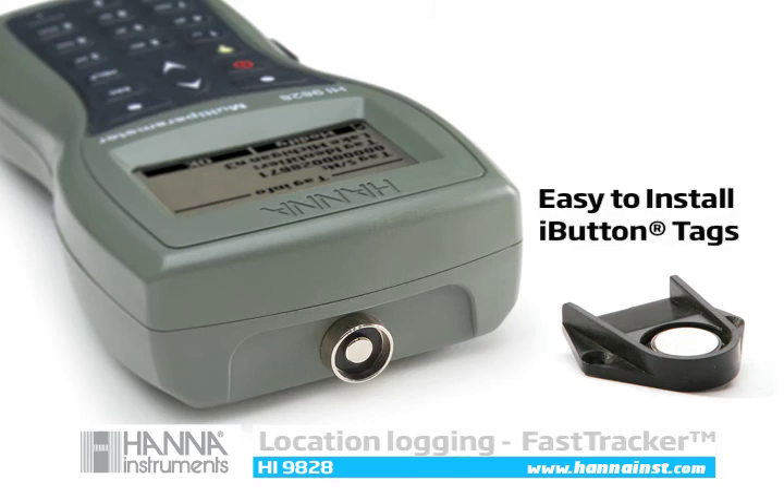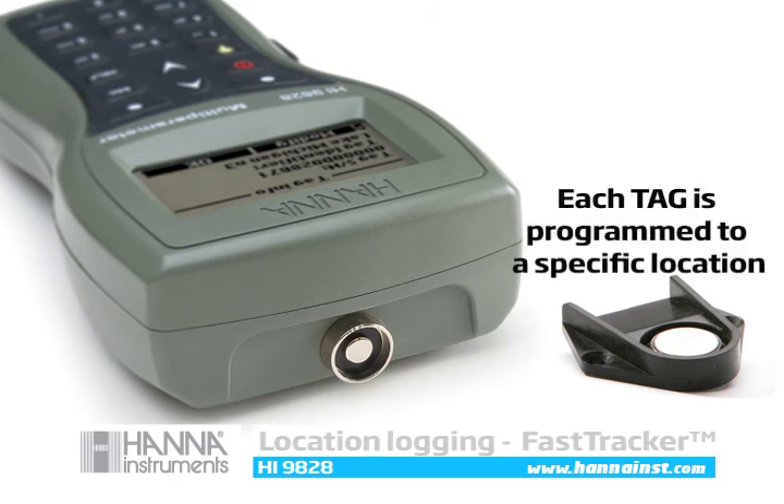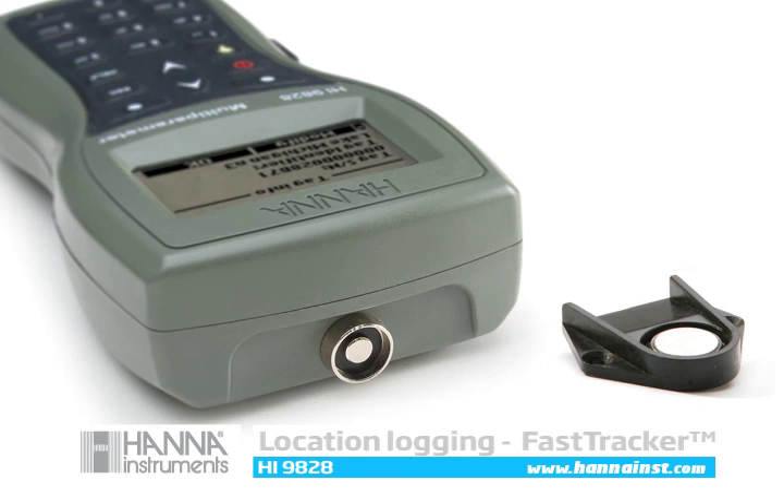Fast tracker tag ID uses stainless steel eye buttons with unique codes that install right near sampling sites. Measurement, location, time and date are recorded when the HI9828's tag connector connects with the I button. The fast tracker is a perfect complement to the HI9828's GPS.